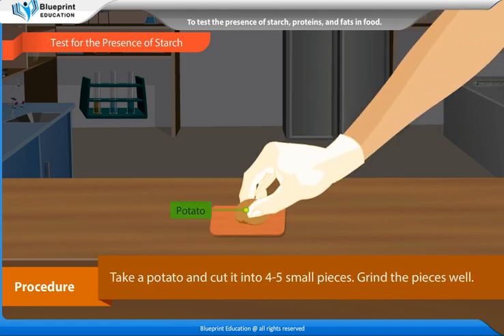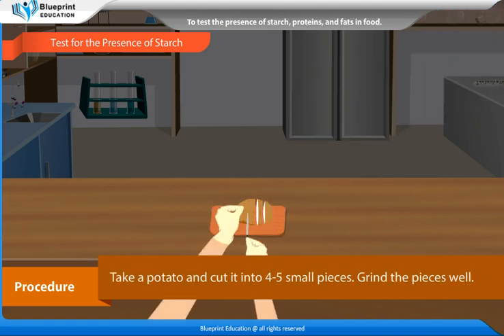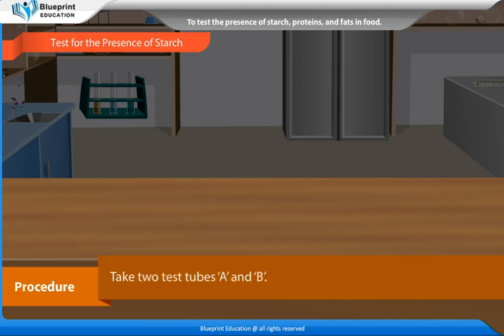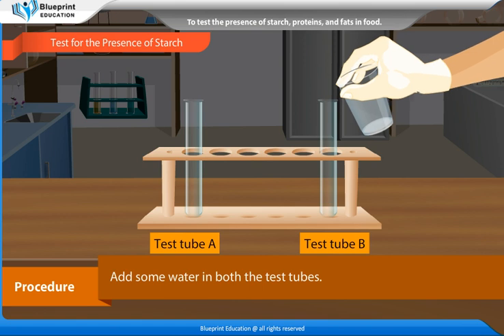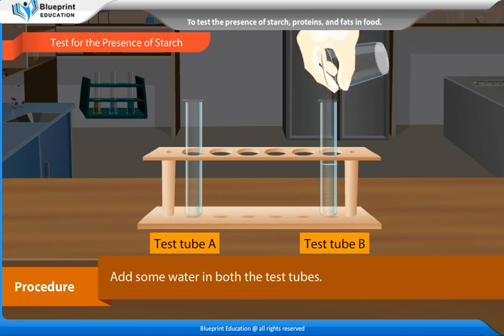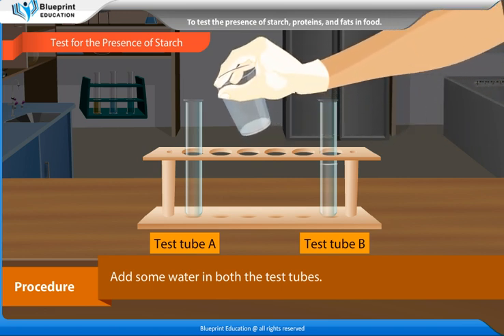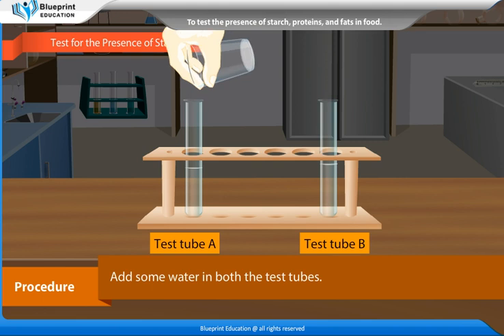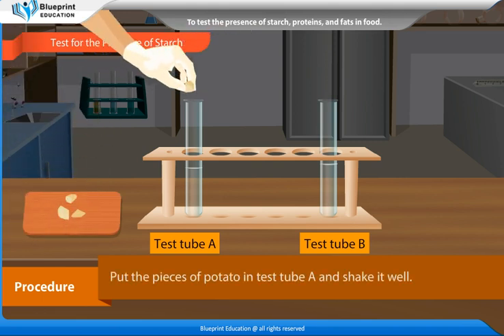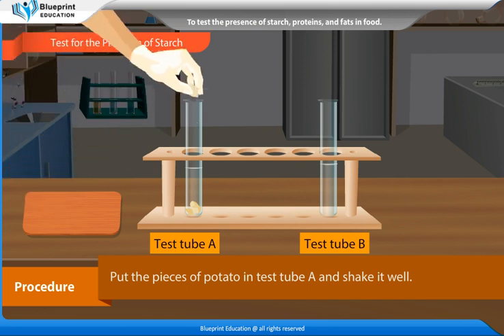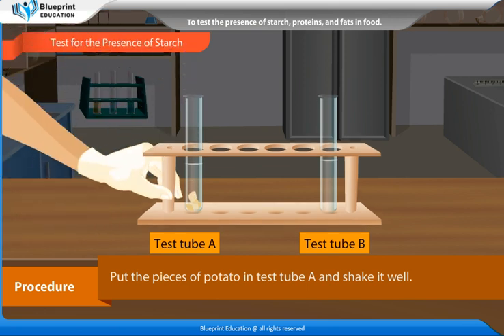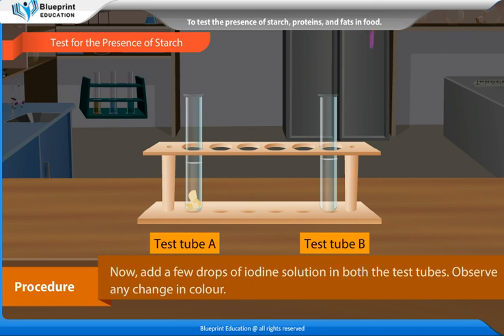Test for the presence of starch. Procedure: Take a potato and cut it into four to five small pieces. Grind the pieces well. Take two test tubes A and B, and add some water in both. Put the pieces of potato in test tube A and shake it well. Now add a few drops of iodine solution in both test tubes and observe any change in color.